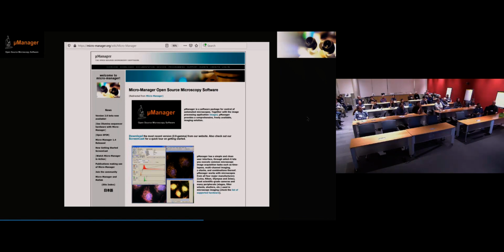The other part of it is the website. We set up this wiki-like thing and encourage everyone to edit that, which happens to some extent. It's still a rich form of documentation. I don't know if Google is cheating me, but usually when I search for something microscope hardware related, it brings me to this website. Personally, I don't remember everything either, and just look it up here.